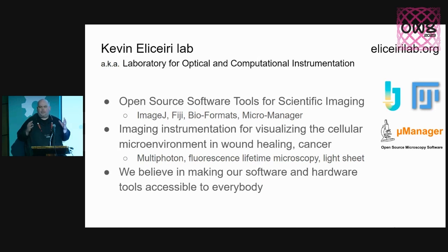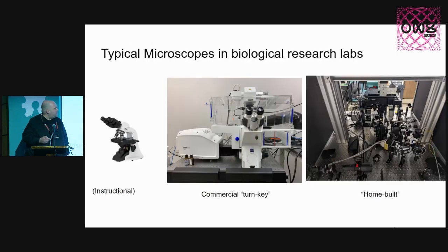Usually you publish a PDF, and in there you might have a picture of your instrument, you might have a description in text, but it wouldn't really help even an experienced builder build it. You're missing a lot of content. And so that's been our challenge: how can we be more open, because we're all building on each other. We're all helping. The innovation is all based on people's work, like all of you, and how can we be more open in that sharing? So this is typically what you see in our field.